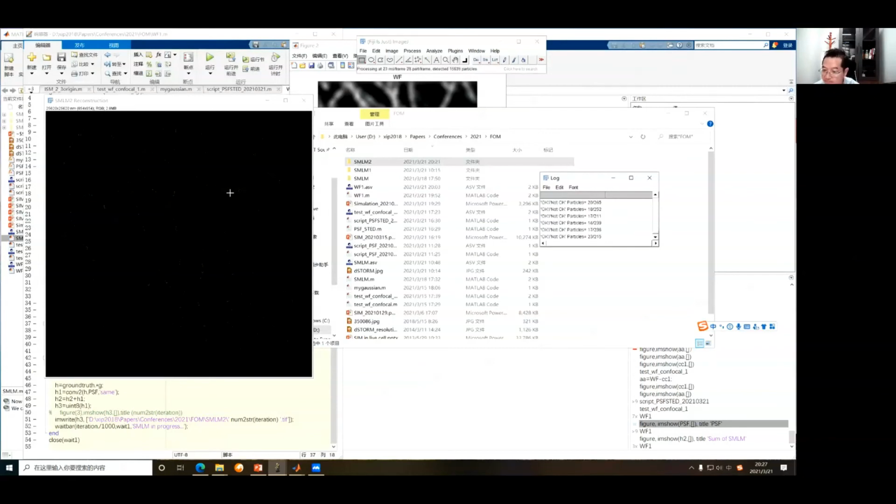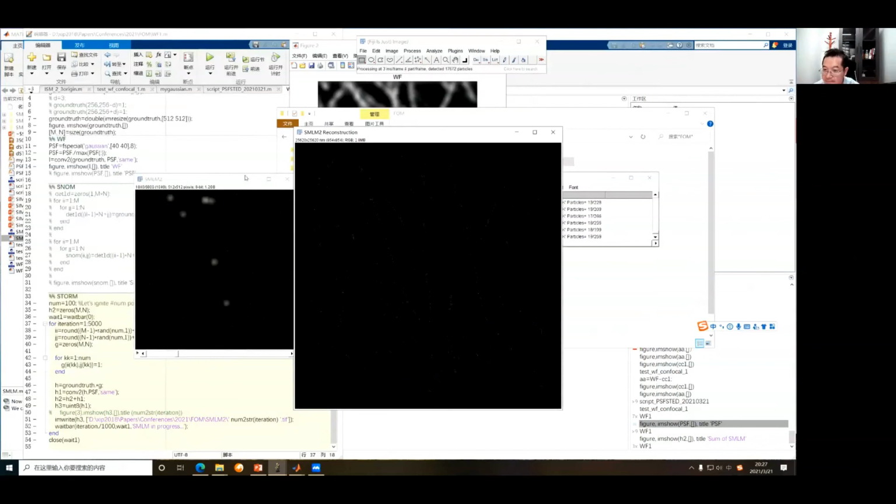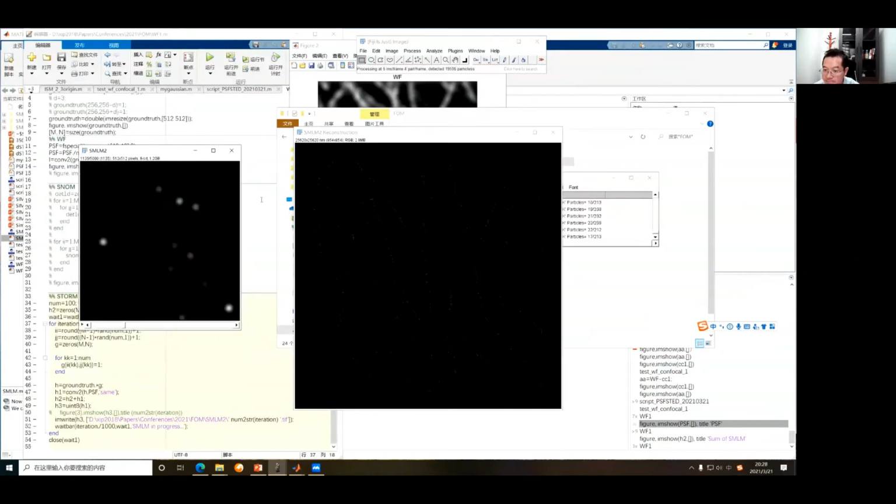.2 file to build up all these modules, I must say. After that, we get a much denser map. As you can see already now, of all these molecules, their possibility to appear.